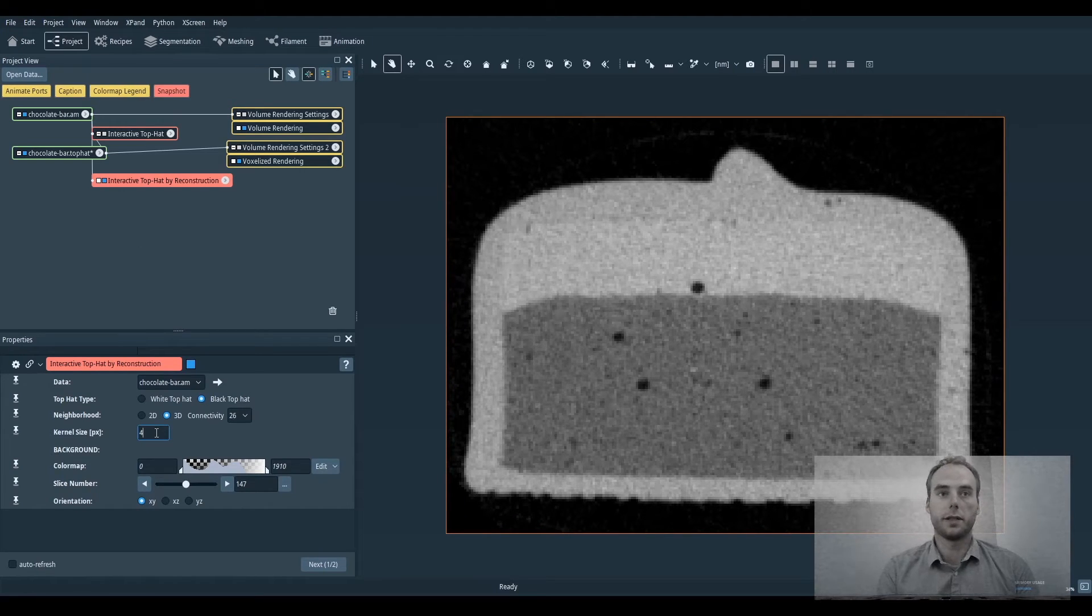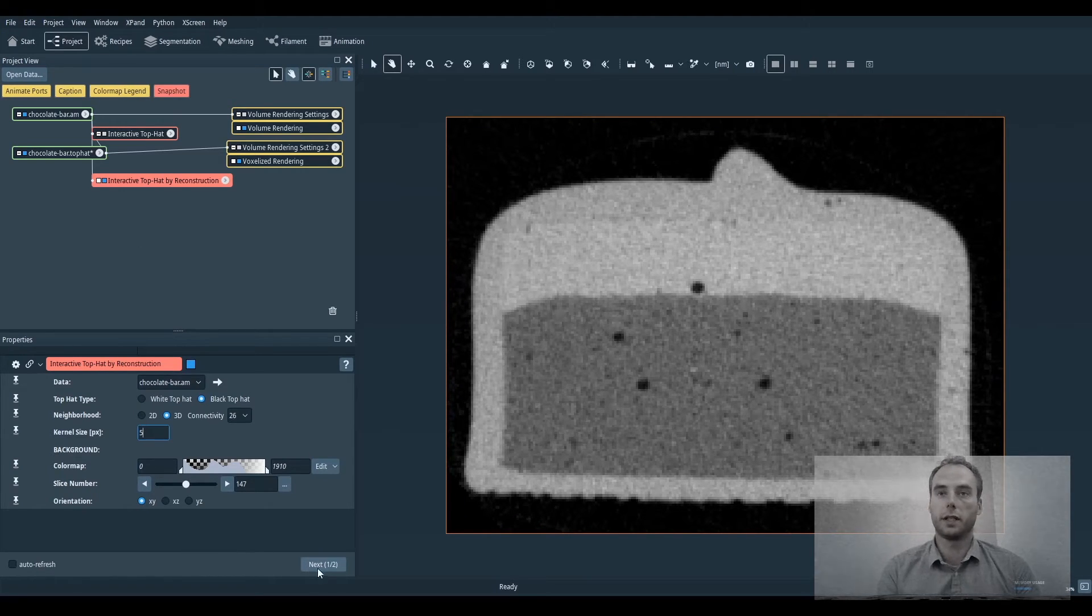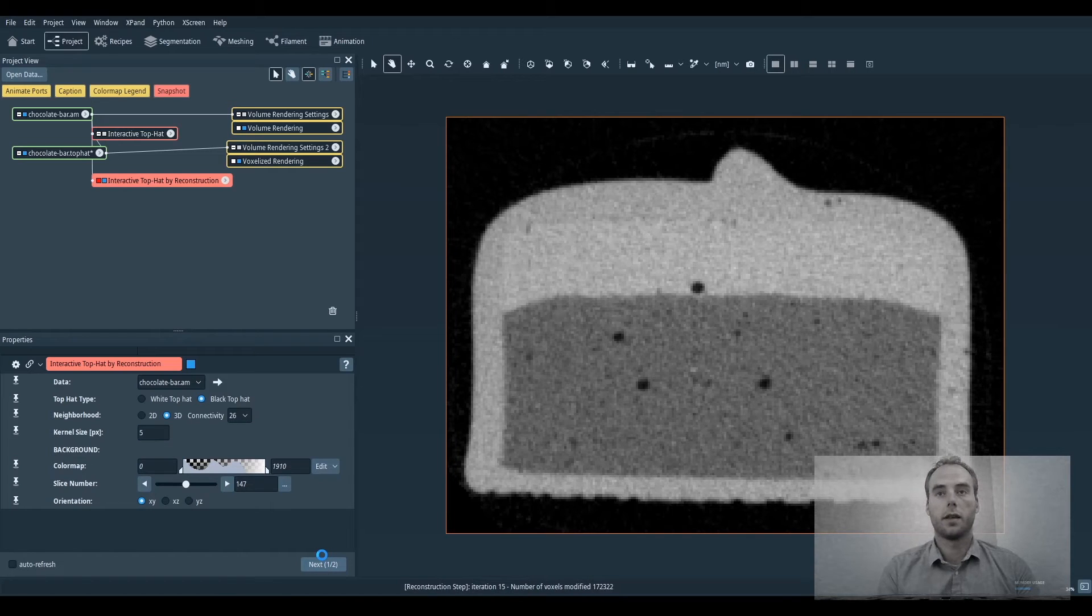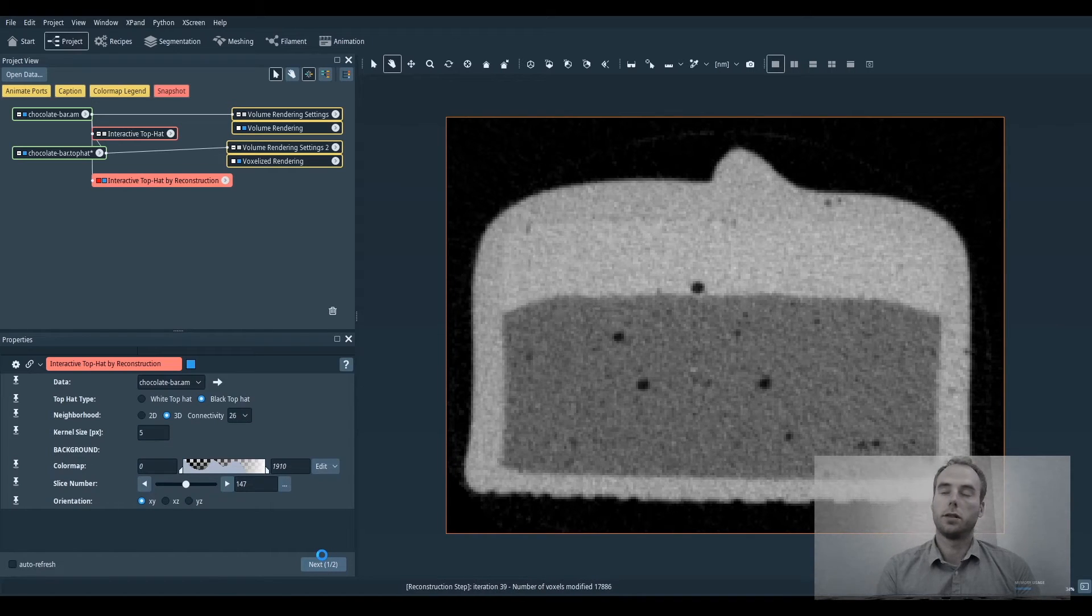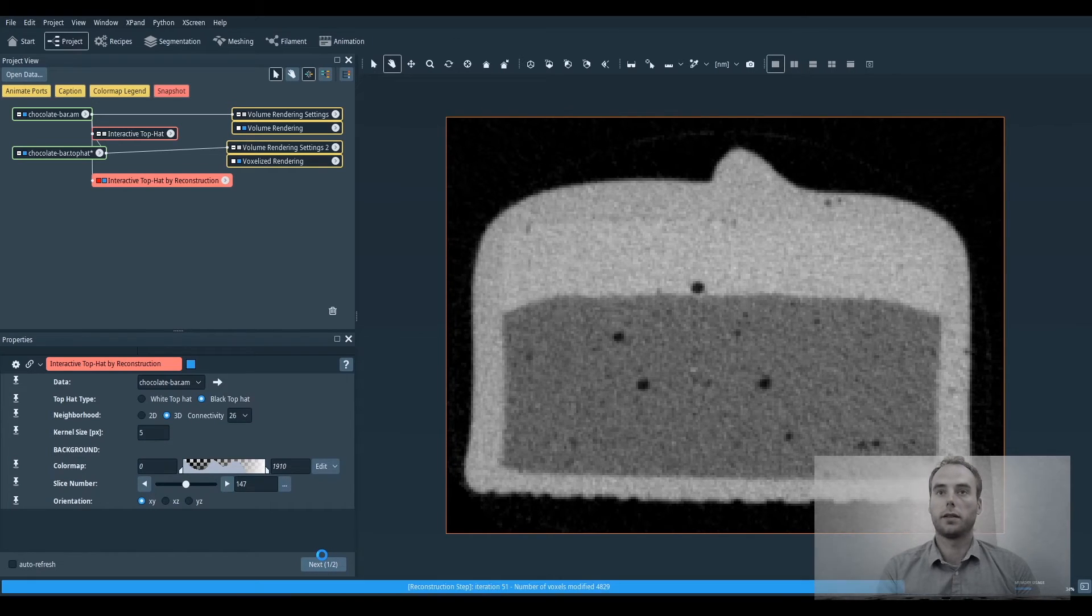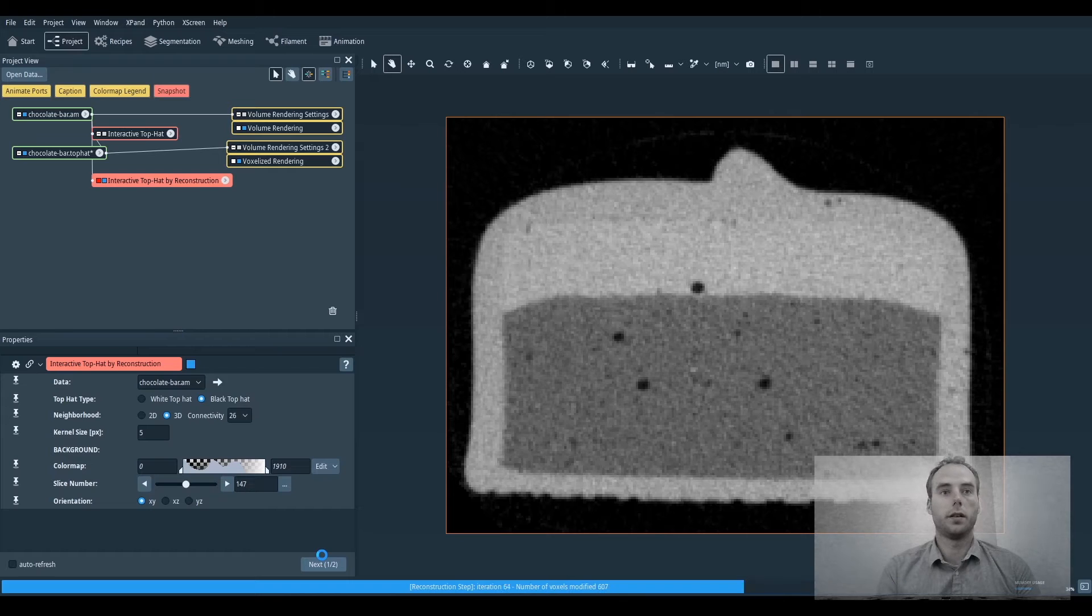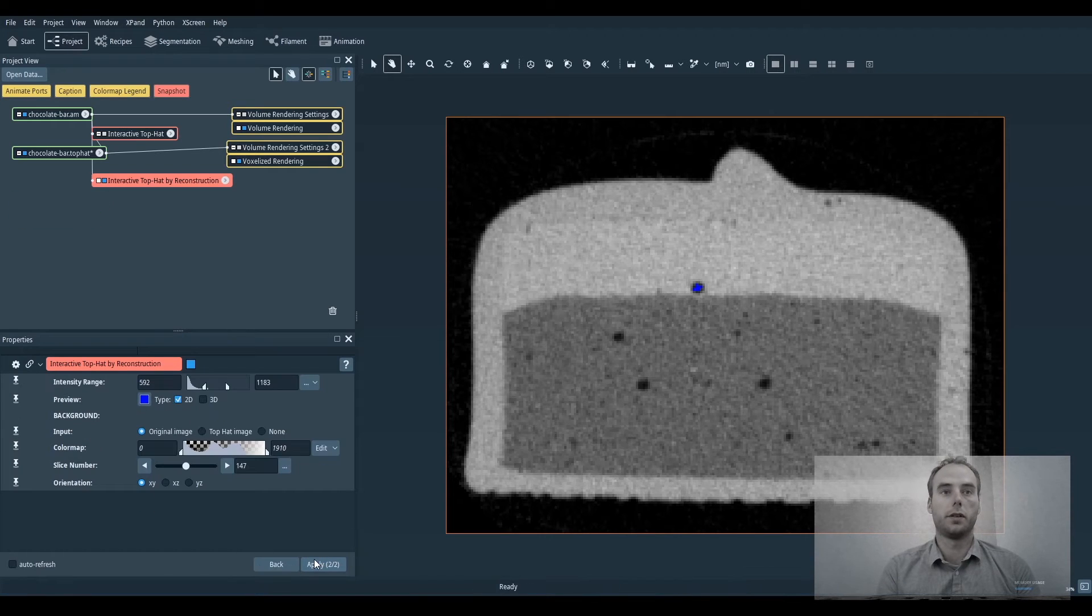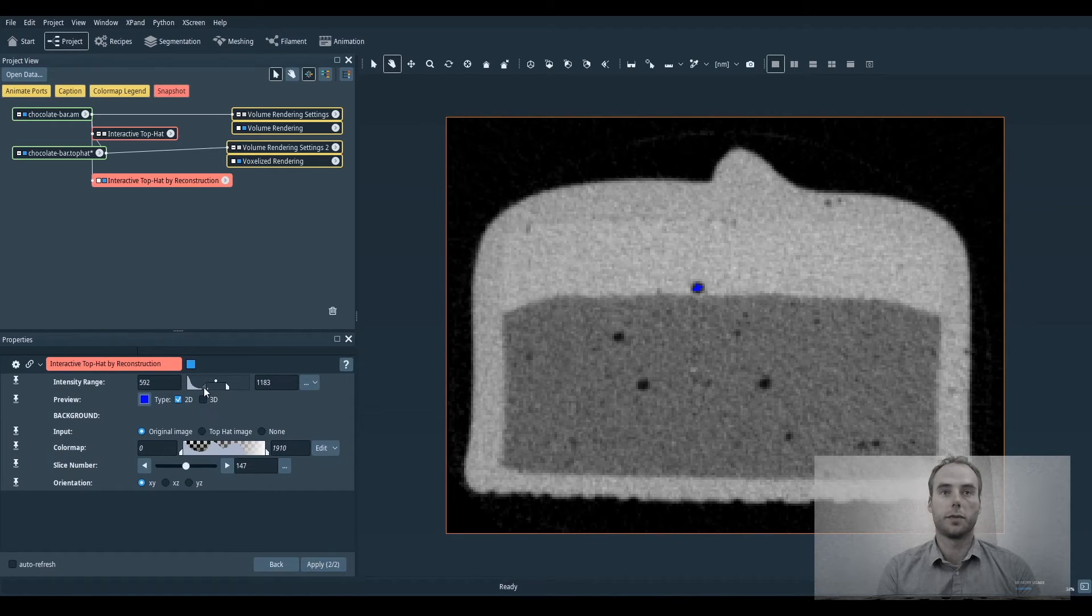So the first step is still to set the size of the internal porosities. Then you set the threshold of the internal porosity you want to segment.